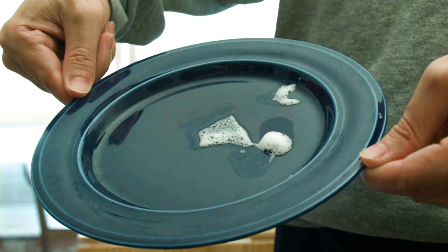Right now we're going to look at some suds. Trevor was kind enough to lather up his hands with some dish soap. We've got some suds here on a plate and we'll show a little shot of that there. Let's take a look and see what this looks like up close. These bubbles are going to start popping, so we've got to get them now. They're probably going to look cool when they pop.